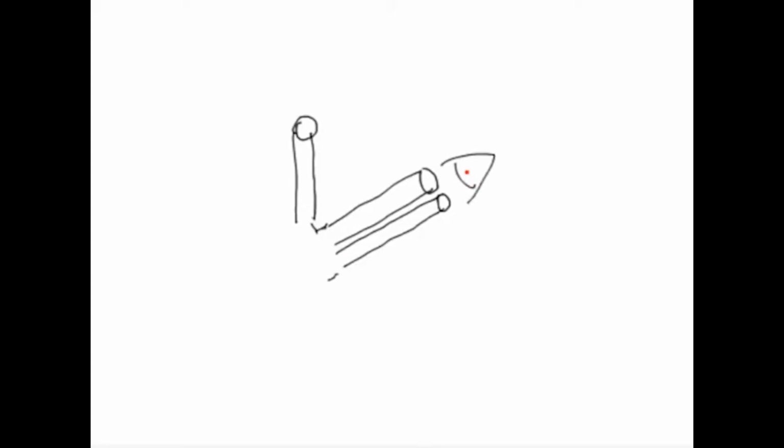Now, in binocular eyepieces, the light rays, the wave trains coming from the objective, will be split and then enter the two eyepieces. The trinocular port, where you have three eyepieces, could be used for different purposes.